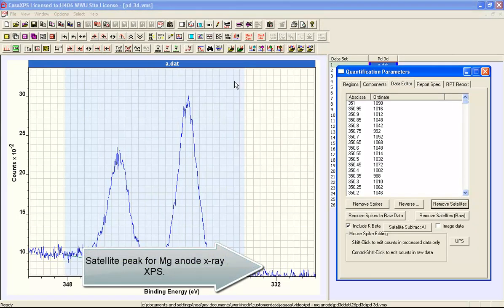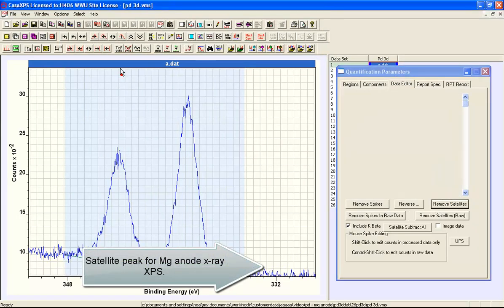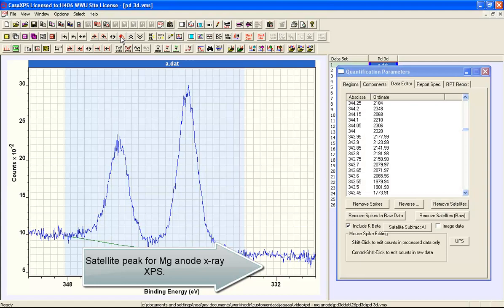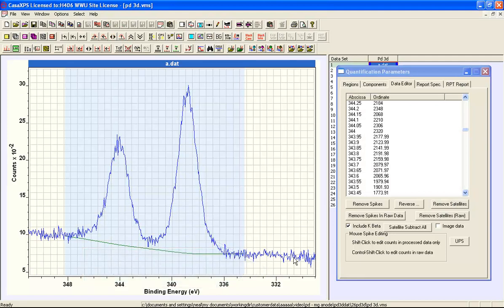And this processes the data and produces a background that has the satellites removed.